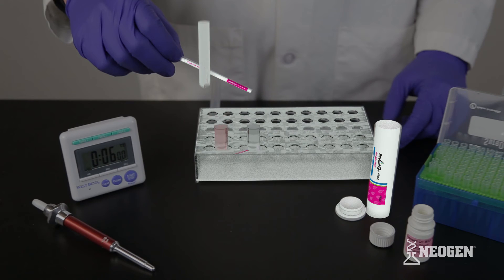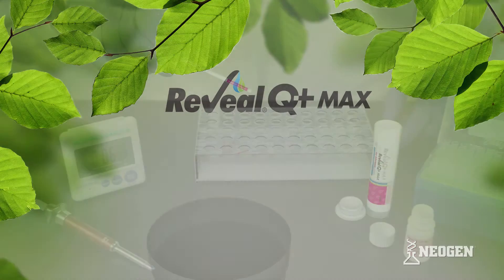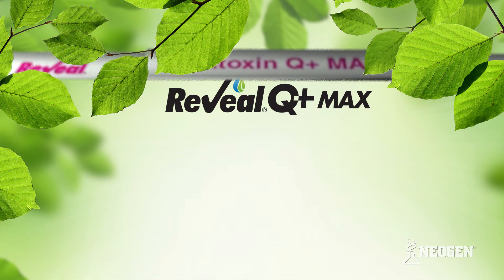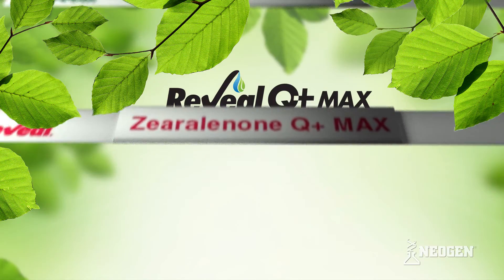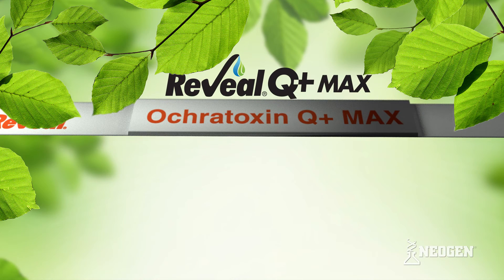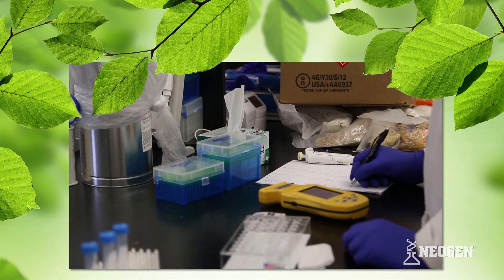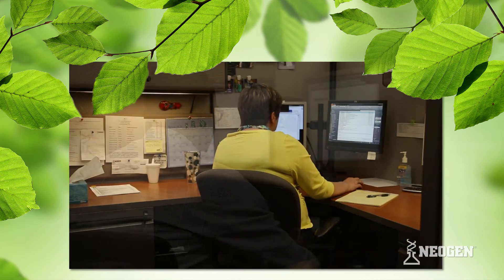When you're done using Q Plus Max to test the sample extract for up to six different mycotoxins, you can dispose of the testing materials as you would with any other non-hazardous material. Neogen's Reveal Q Plus Max product line includes tests for aflatoxin, deoxynivalenol (DON), fumonisins, zearalenone, T-2/HT-2 toxins, and ochratoxin.